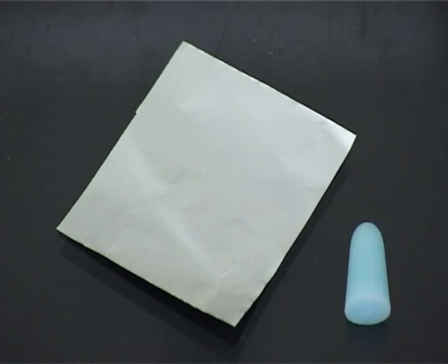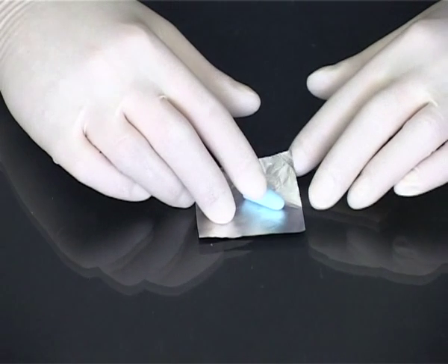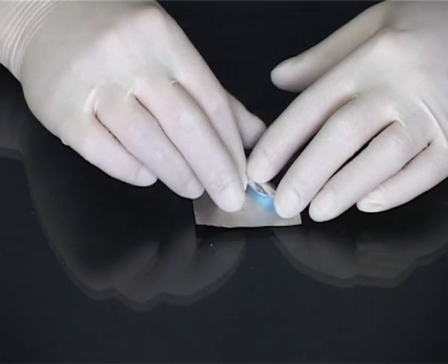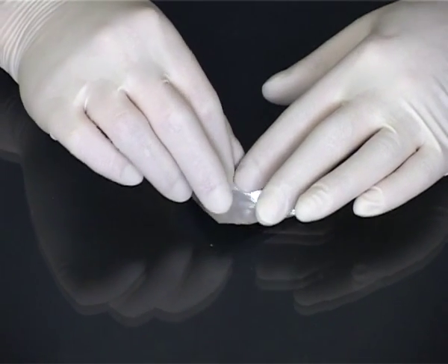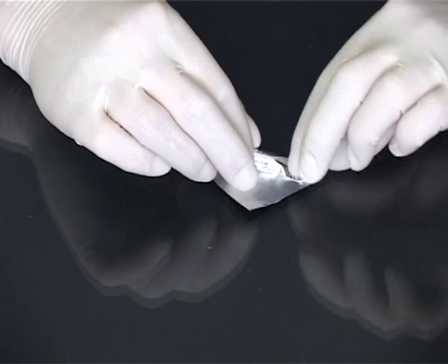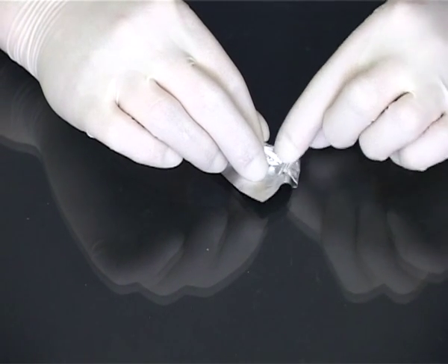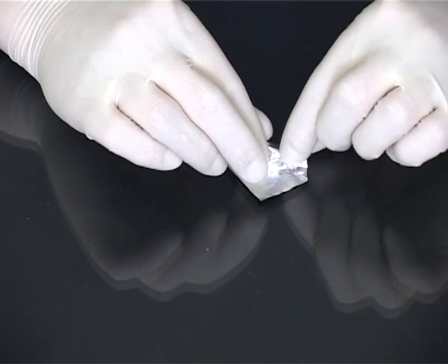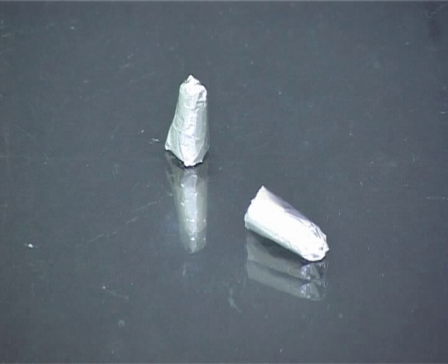Once removed from the mould, the suppositories need to be wrapped individually. Aluminium foil is usually used. The suppository is wrapped in a suitably sized piece of foil. This produces neatly wrapped suppositories.